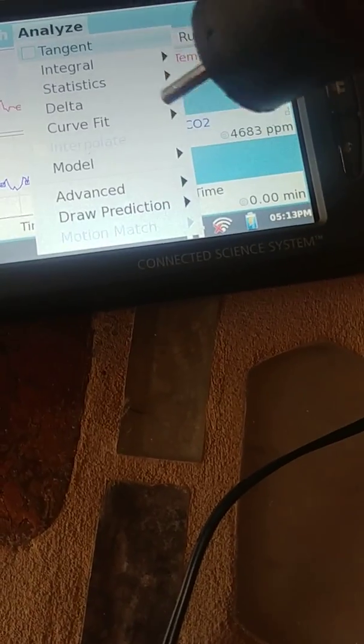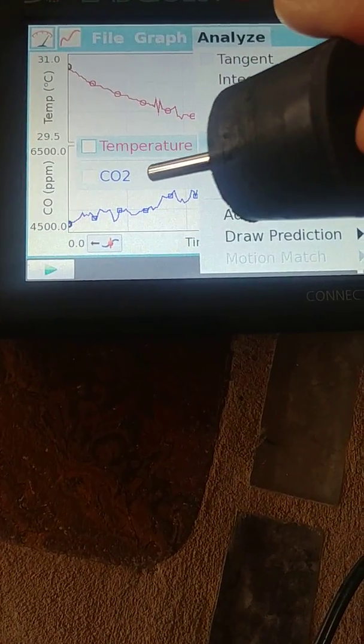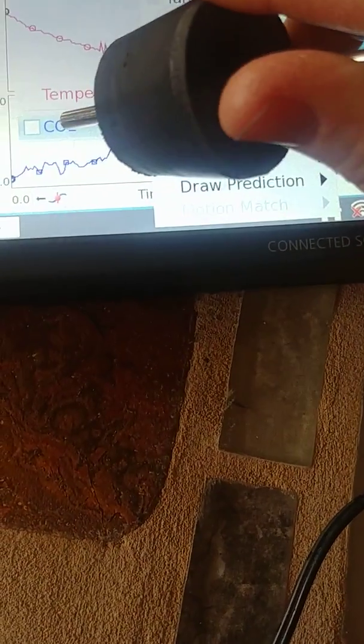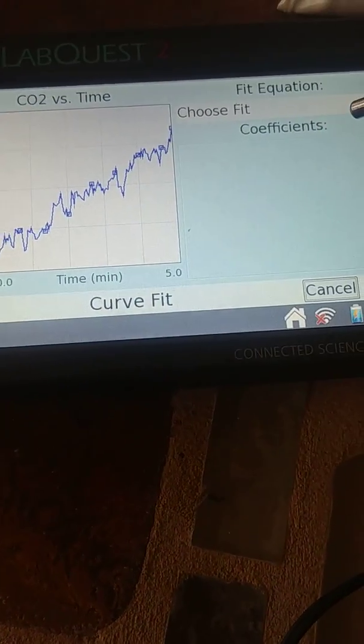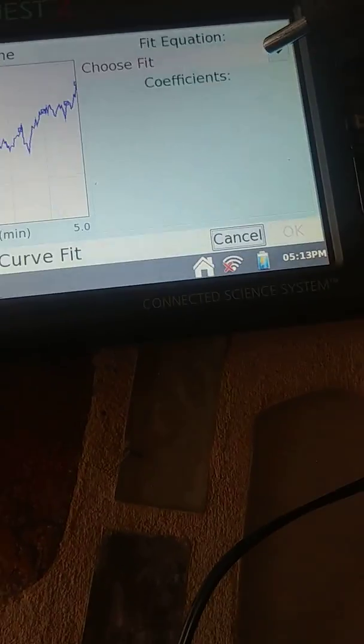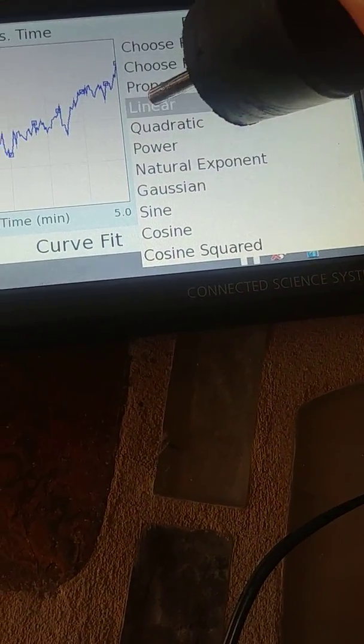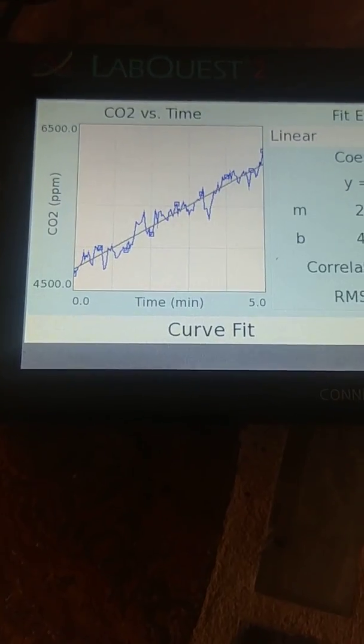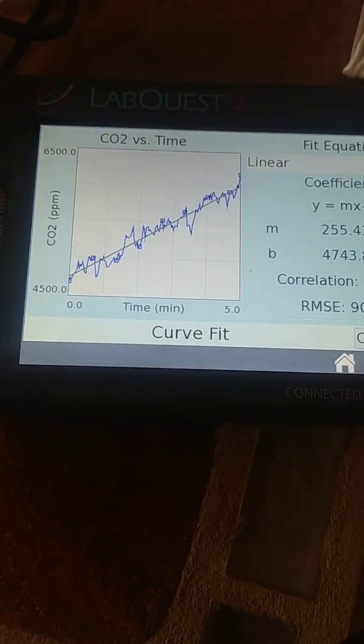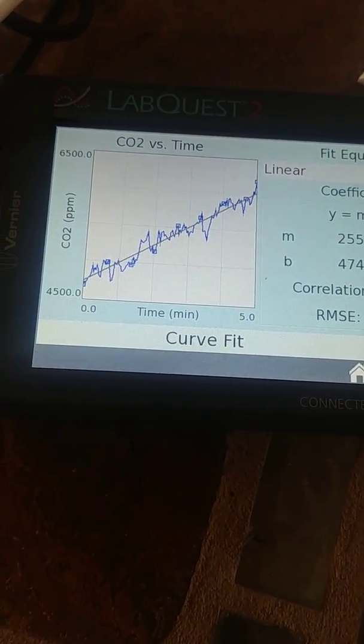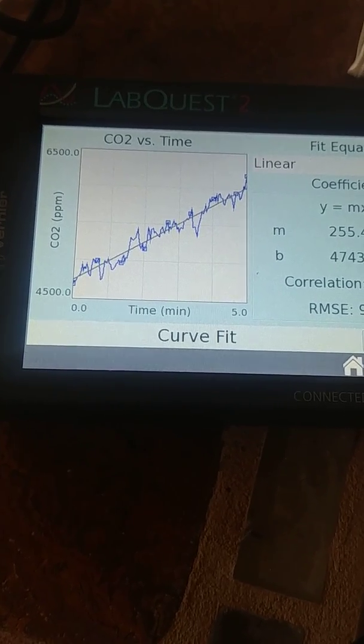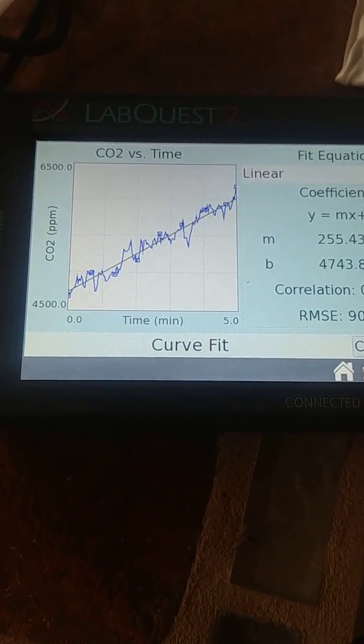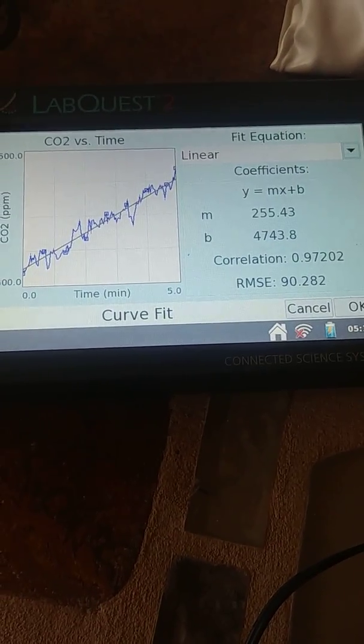and then we're going to choose a linear fit and that's going to fit a line to our data. This line is going to give us the slope, among other things, it'll give us the slope of the data. So remember from algebra, Y equals MX plus B.